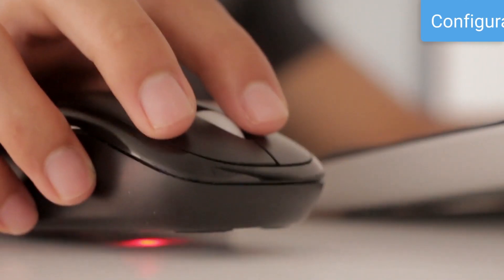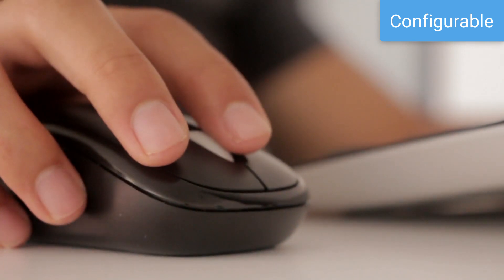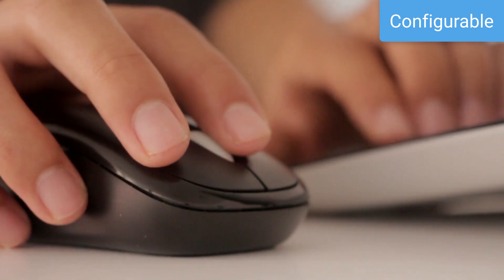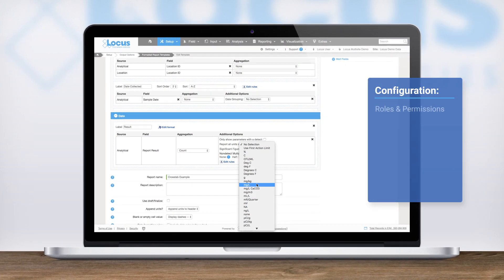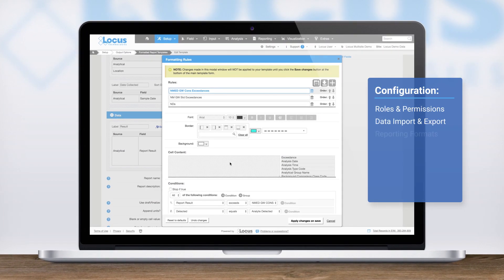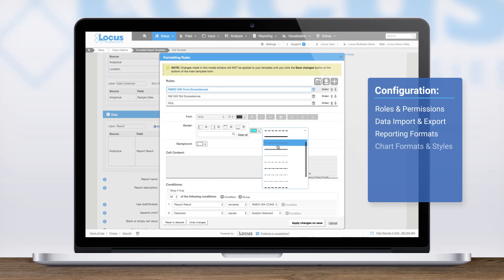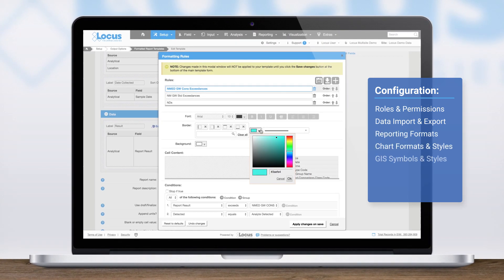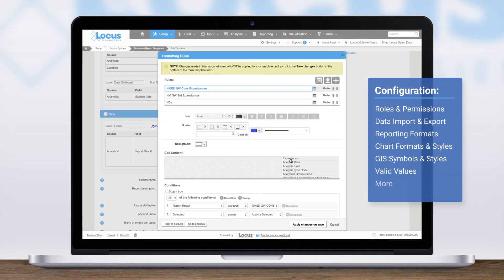EIM is configurable. You have the ability to tailor many parts of the application to meet your specific needs. Configure things like roles and permissions, data import and export formats, reporting formats, chart formats and styles, GIS symbols, styles and layers, and valid values.